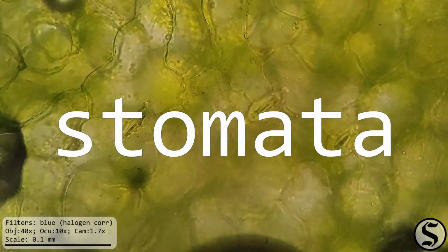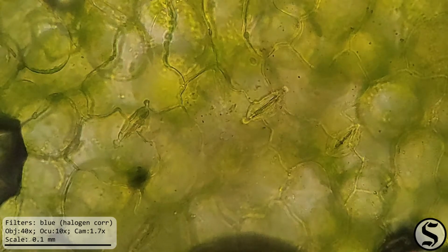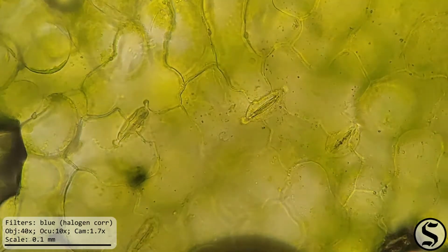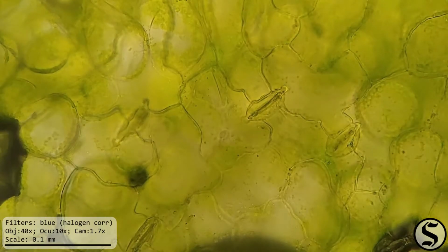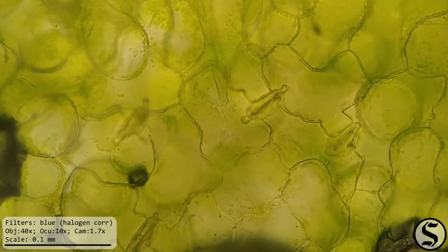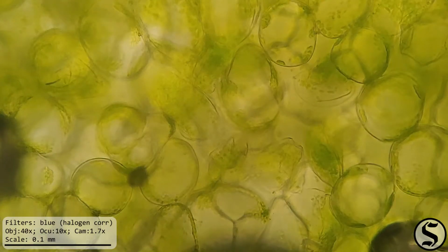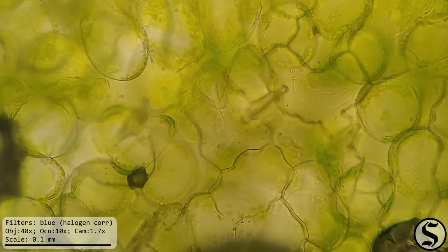That's from the Greek word for mouth. That's how the plant breathes. Some plants, especially many trees, have stomata only on the bottom of their leaves. Some floating water plants have them only on the top, and many plants, including spinach, have them on the top and the bottom. So that means we are looking at a piece that's facing the wrong direction. So let's check out another piece.